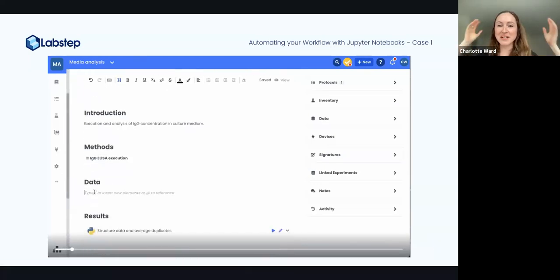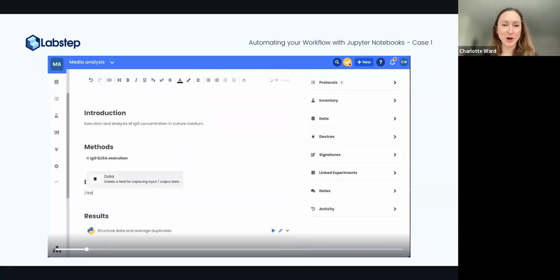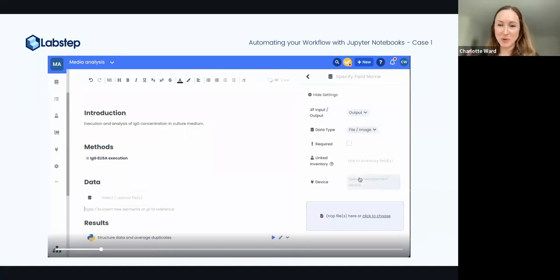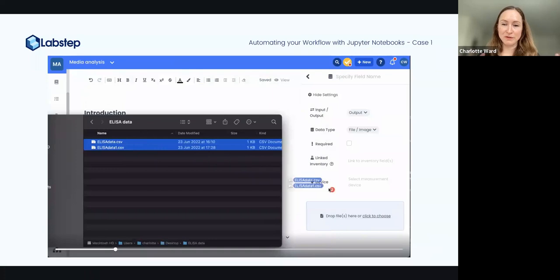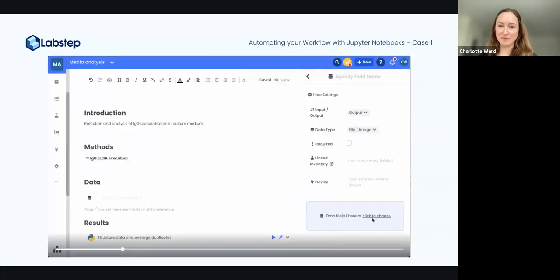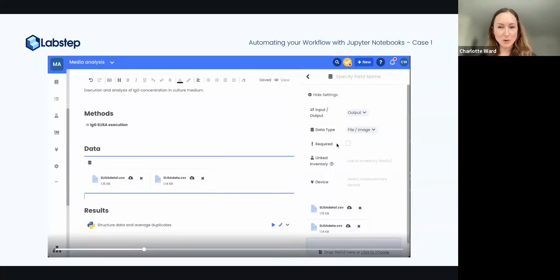This gives a little bit more context as to how you can use these in a useful way, because as you say, you probably don't want to print out hello world 4 times. In this very hypothetical example, we've got a mock-up of an ELISA. We've done an ELISA and we've got some hypothetical data sets out of it. We're imagining we've done duplicate analysis of our samples, so we've got 2 data sets from 2 plate readings.